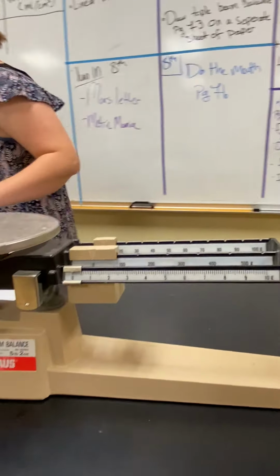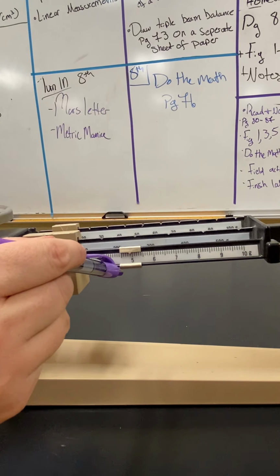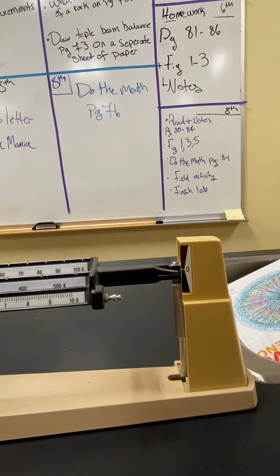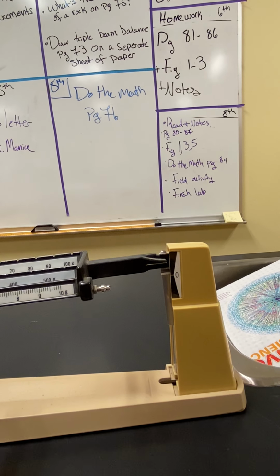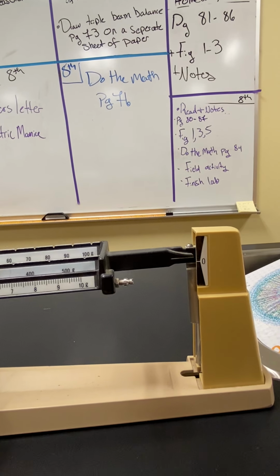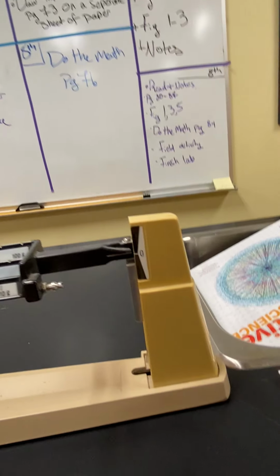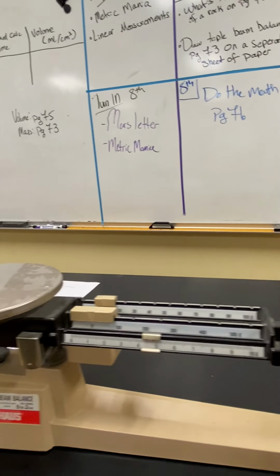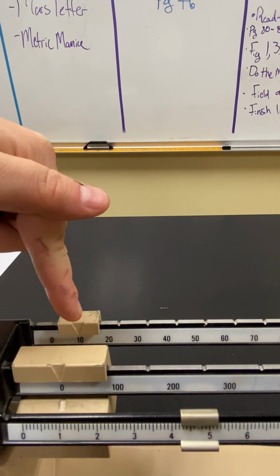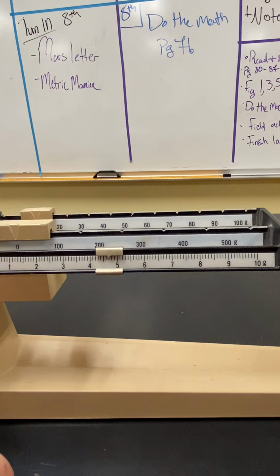Now, we are going to move the ones next. I go into the middle, but to five. That's almost there, it's almost there. Needs a little bit lighter. So let's go to 4.5. There we go. A little bit light. Split the difference. Close enough. All right, so if you look at our tens, we have 10 grams at least. And then we have 0 hundreds. And we have, let's say that's going to be 4.7.